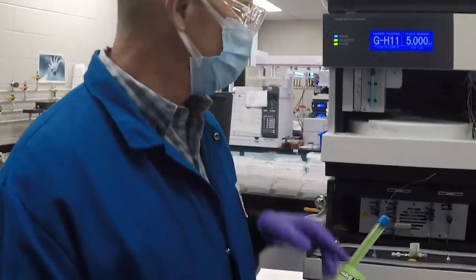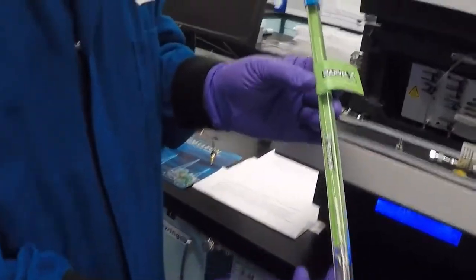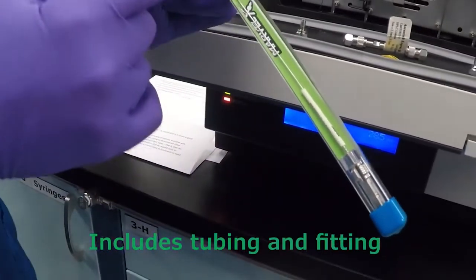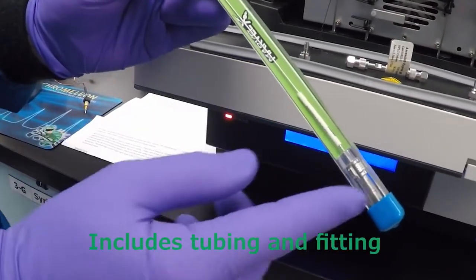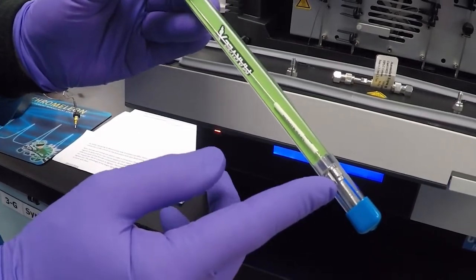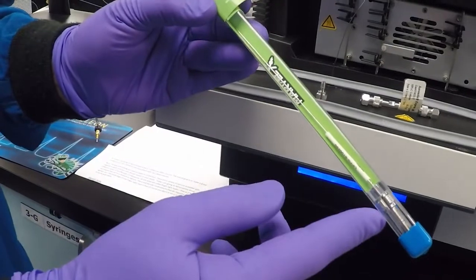Today we're going to install an HPLC column into the LC using Marvel X tubing. It comes with a piece of tubing and the fittings to match it. You need the Marvel X fittings to work with this tubing, and you need this tubing to work with the Marvel X fittings.